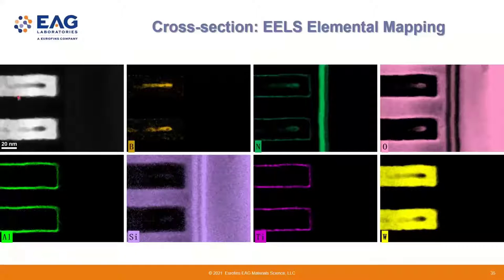But in this particular case, the boron is somewhere here. So I did actually go into the raw data, and the nice thing about boron is that there's some good reference spectra in the public domain, really about the boron and the boron oxide type of bonding, right? So the nice thing about the EELS is that you see an edge there, and you can just go there and double check the so-called shape of the EELS spectra, and then give you more confidence, right?